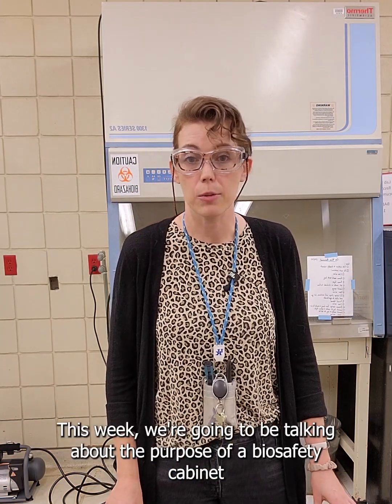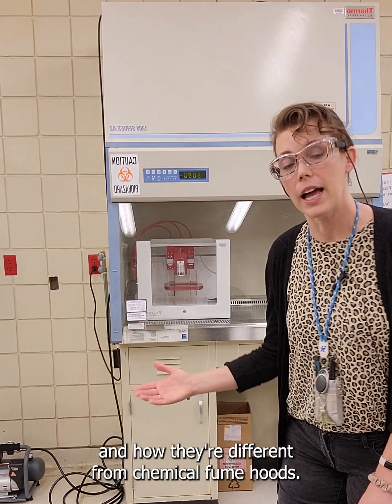Hi, welcome back to Lab Lab. This week we're going to be talking about the purpose of a biosafety cabinet and how they're different from chemical fume hoods.